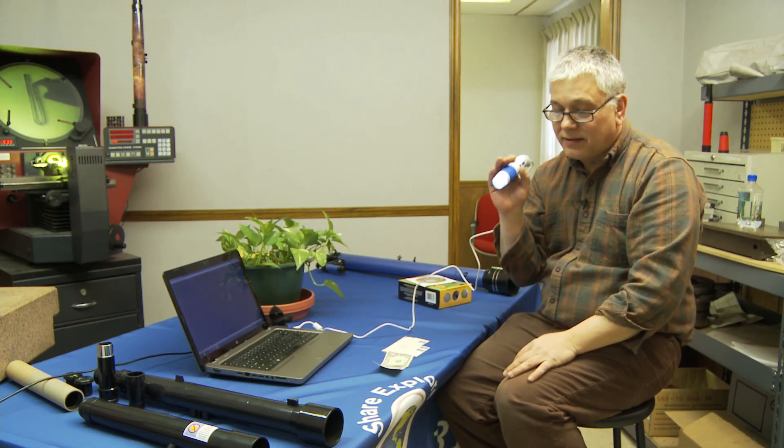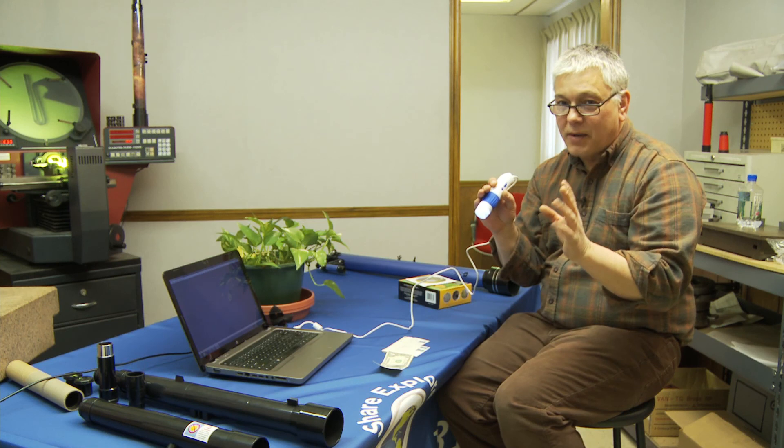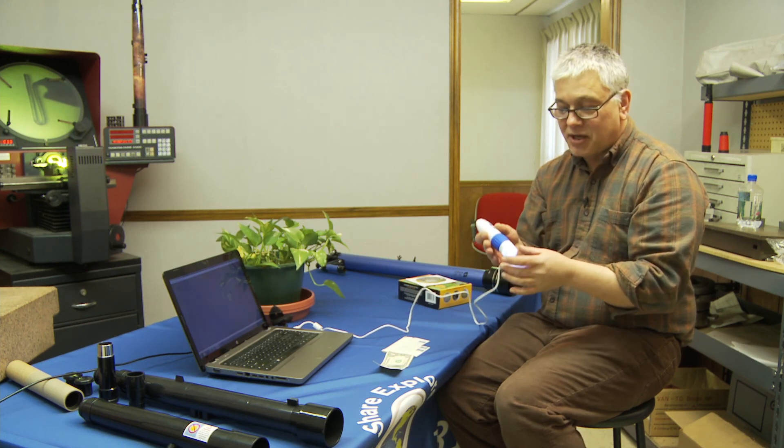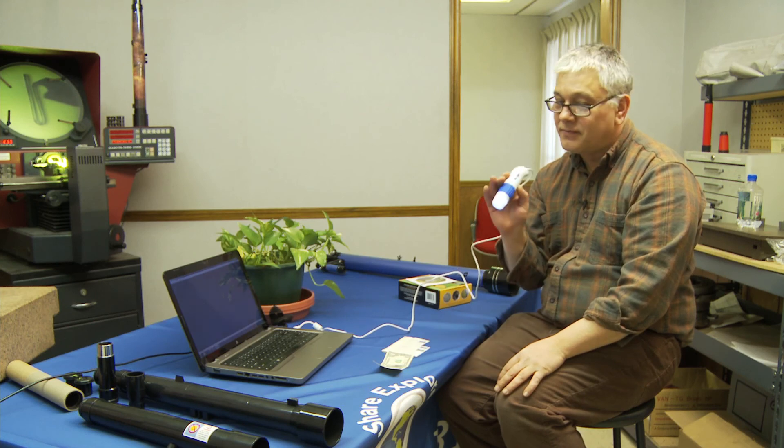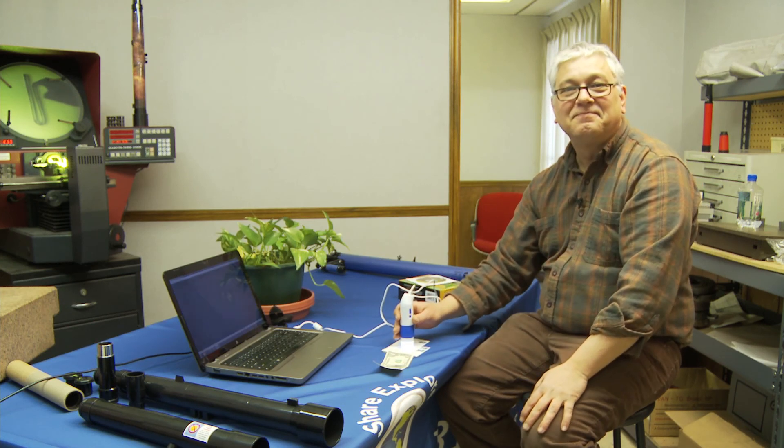A lot of things you can do with it. A lot of fun. Go to our website, learn more about it, see some of the experiments you can do. Good for the classroom. Just a good unit. Bye, thank you.